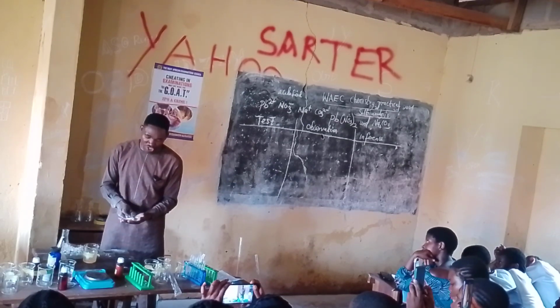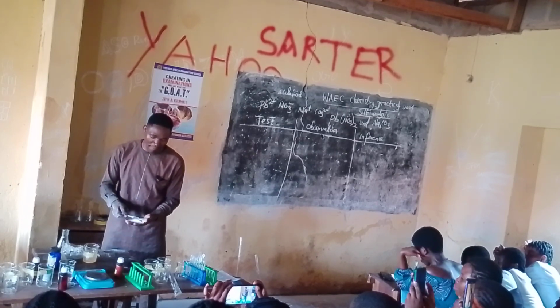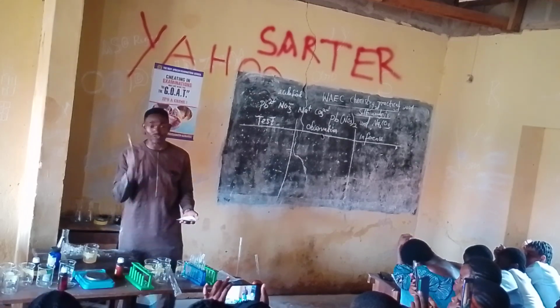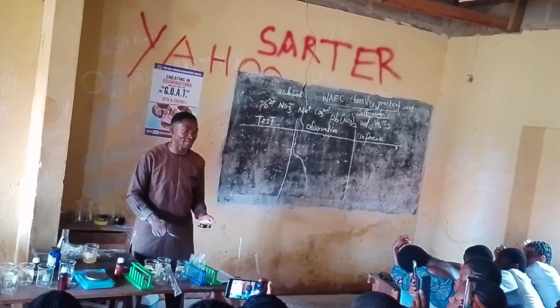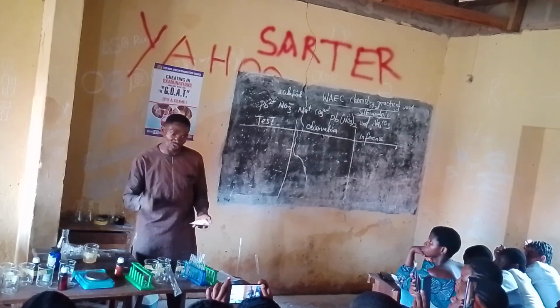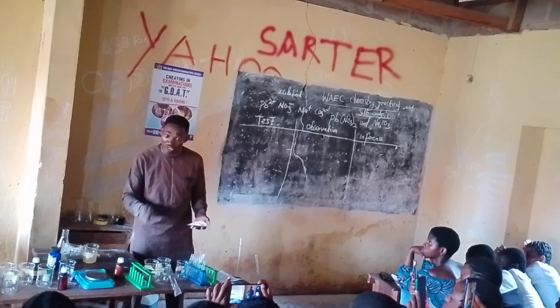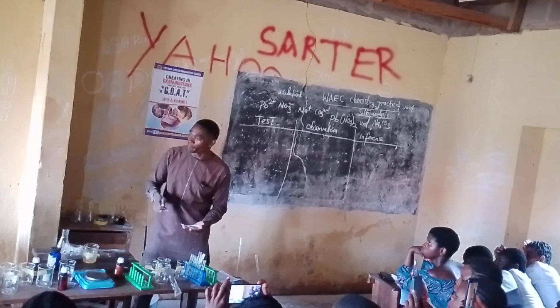The first question you will hear, they can ask you what is the texture, what is the appearance of sample C. But sometimes they don't ask. First question is usually solubility. Sample C plus distilled water plus filter. Sample C plus distilled water. Is it soluble? Is it partly soluble?